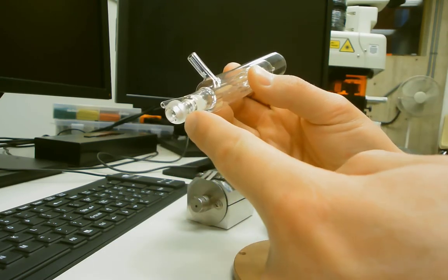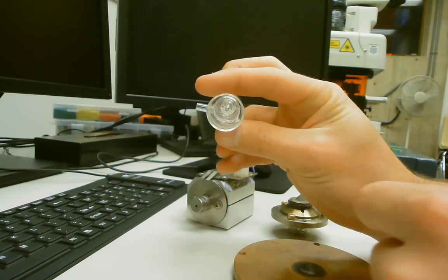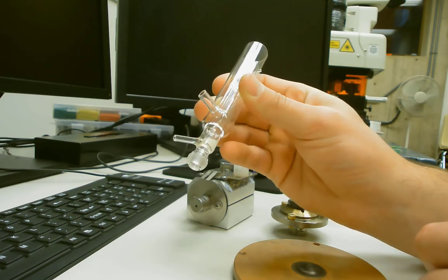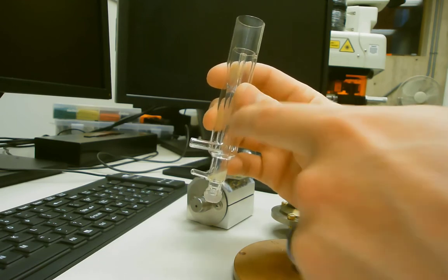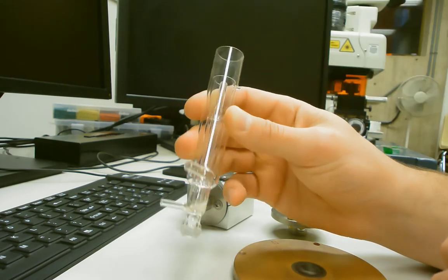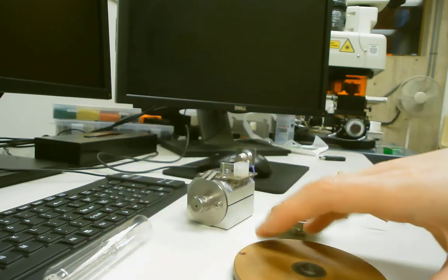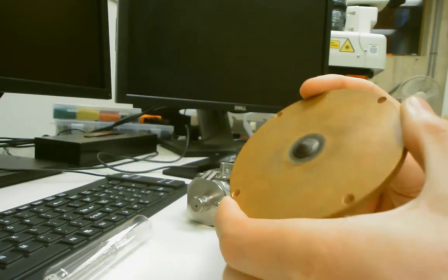The sample stream comes in here in the center. There are three concentric tubes in there, and the sample stream comes in the center, whether carried by helium or by argon. And then the coil was wrapped around the end of the torch here, where the plasma is generated. The plasma was then running up against the sampling cone, skimmer cone.